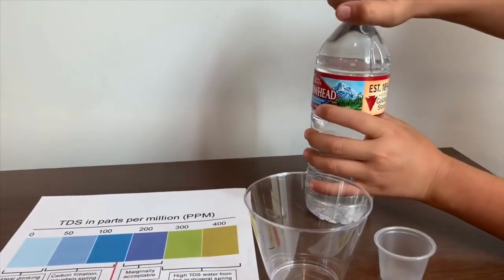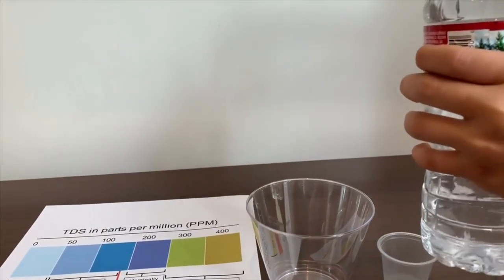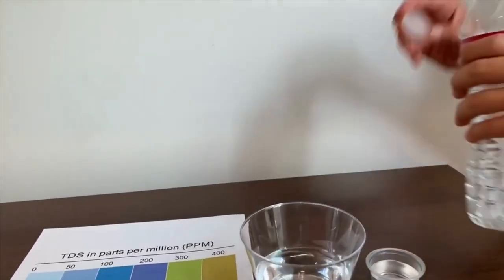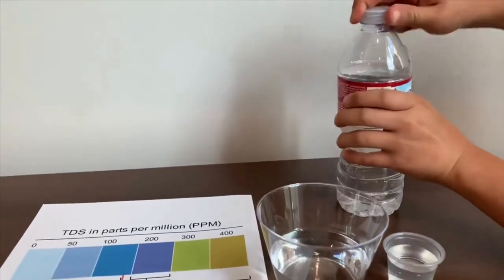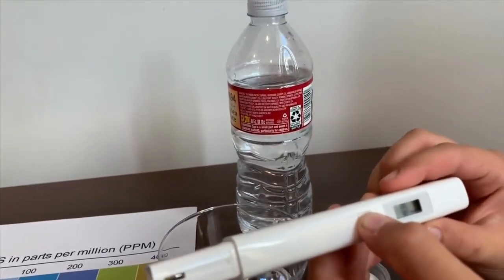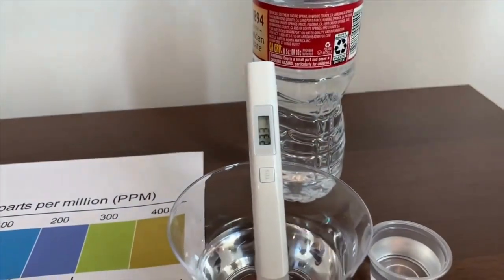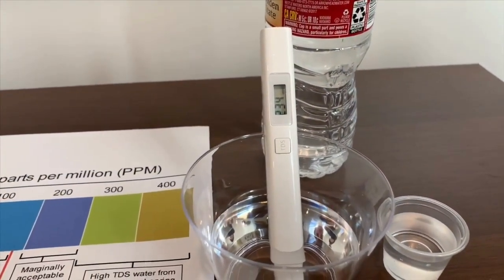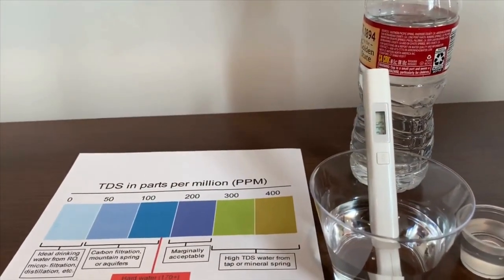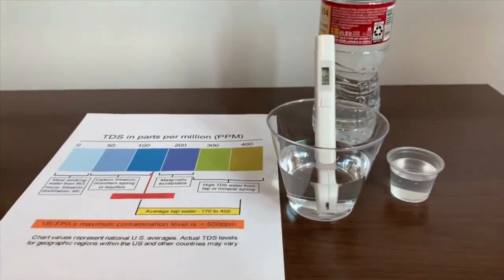Now let's test the other water. It's 100% mountain spring water. Let's pour some in. First let's test the TDS — turn on the TDS device, make sure it says zero, and put it in. It is 234 — that is also marginally acceptable. Now let's test the pH.